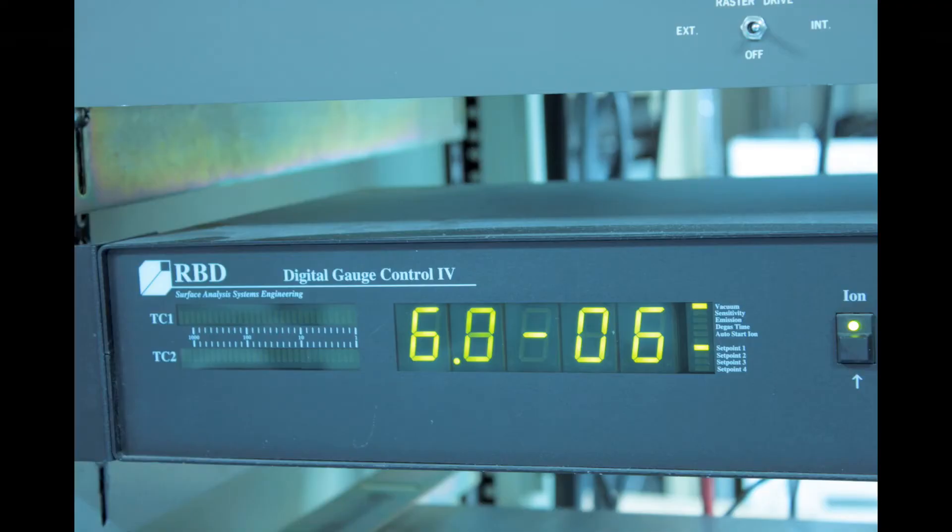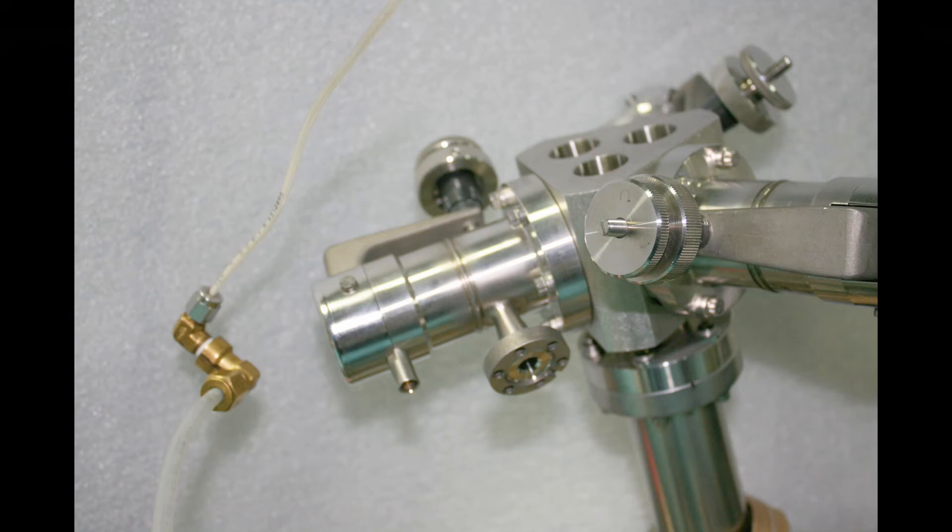Our vacuum gauge is in the 10 to the minus 6 torr range, which is how I know I have a leak, because by now I'd normally be down in the low 10 to the minus 7 torr range. I've rigged up a small 1/16th inch tube connected to a helium bottle and regulated to just a few psi of helium. The small tube will help me to localize the leak.